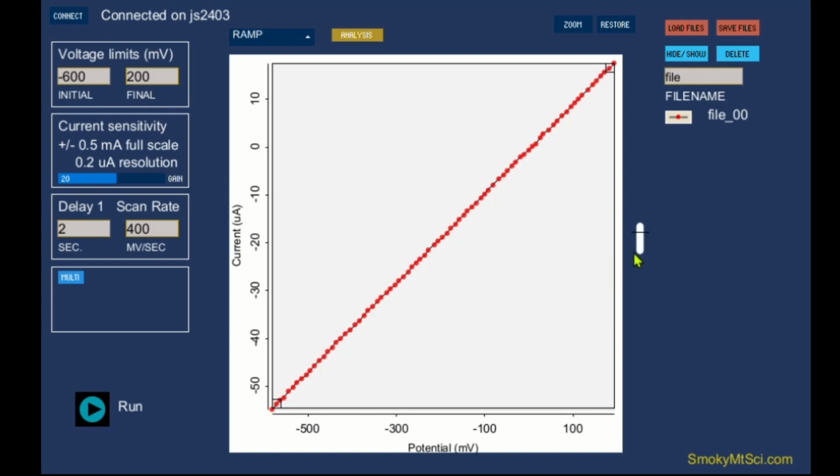Okay, and this is a small fraction of the entire area that this can cover. It can go all the way up to about here, up to the top of the data screen. You can go down to the bottom of that data screen. So let's see what happens when we increase the gain. Let's jump that up to about 32, and we'll hit the run button again. We'll collect another piece of data.